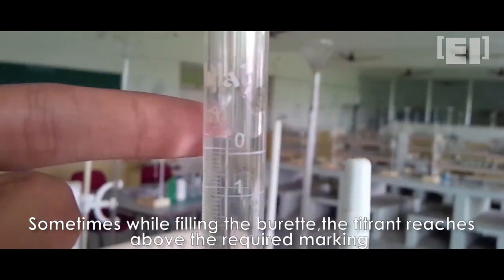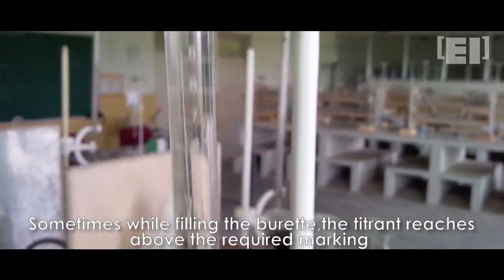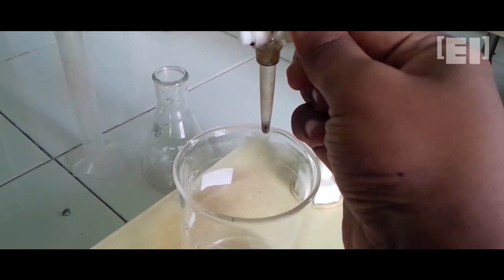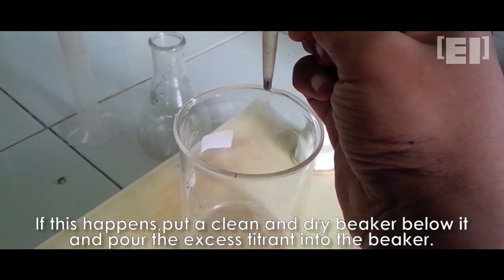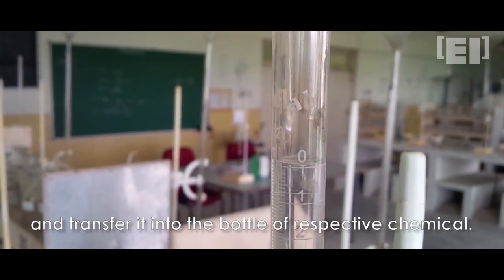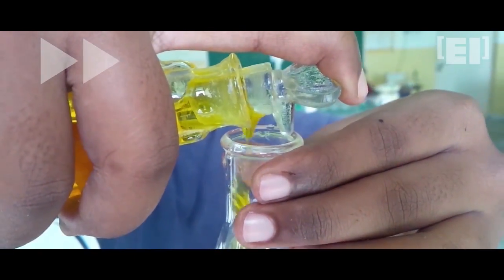Well sometimes what happens is that the liquid goes higher than the zero marking. This is not bad and it can happen very often. That's what happened here too. We'll put the beaker below and take out the excess solution and pour it back into the container. Now pour 2-4 drops into the flask and titrate the solution.